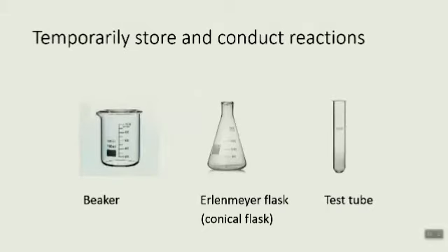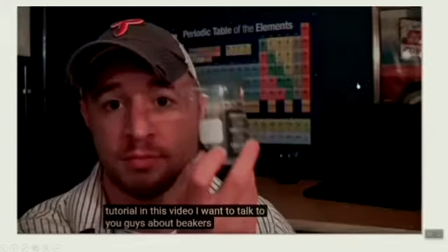Here are some of them. We have beaker, Erlenmeyer flask or conical flask, and test tube. Now let's see the video to know about them. The beaker.